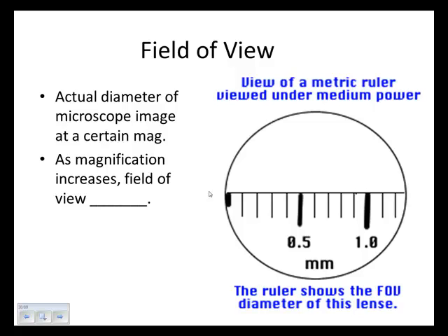If I were to put a microscope, how big is the field of view here? This is somebody who took a plastic ruler, right? There's no law saying that it has to be a stage, right? You could take a plastic ruler. Where do I have a plastic ruler here? I got one right here. Boom, right here, transparent plastic ruler.